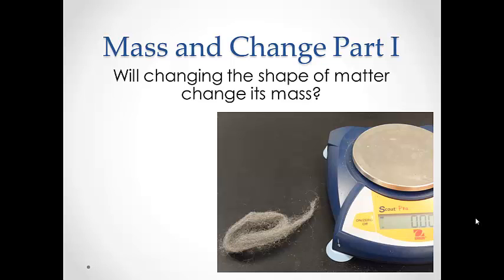Part 1 will use steel wool and a balance. The question for this part of the lab is whether or not changing the shape of steel wool will change its mass. So we will start out with a piece of steel wool. Since we are looking for a change in mass, we will need to know the mass before we change the shape. This is known as our initial mass and is given the designation of m sub i.